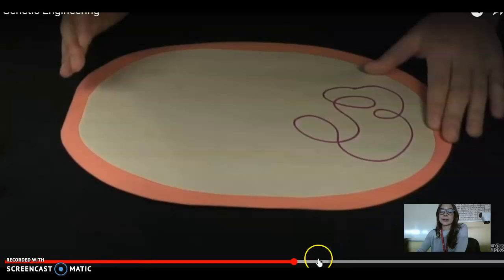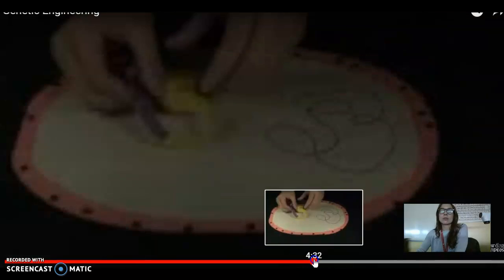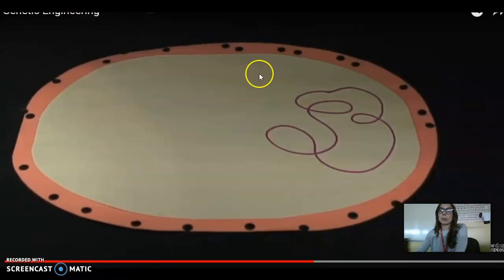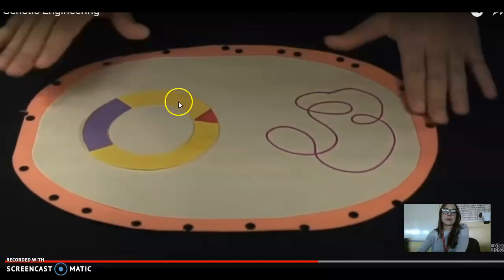So I have this bacteria and I heat shock it. I heat shock it, and that will cause several holes to open up within the cell membrane. And so she visualizes it here. That plasmid sneaks in via one of those holes in the cell membrane. So now the plasmid's in there. It has its own regular DNA. It can do all of its regular stuff. But then I have this new plasmid too. So its machinery, all of its ribosomes, are going to also transcribe and translate this. And the one that took up this nice cool gene that I wanted is going to glow as a result of making these proteins.